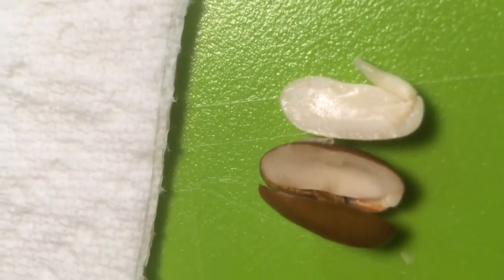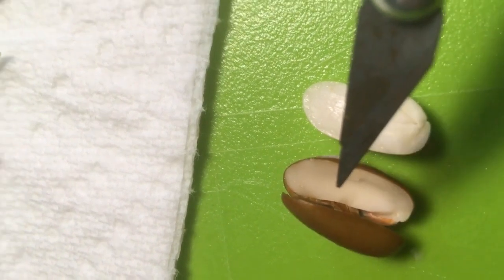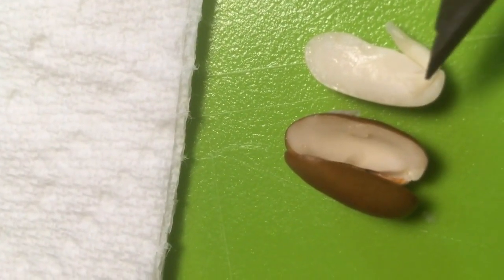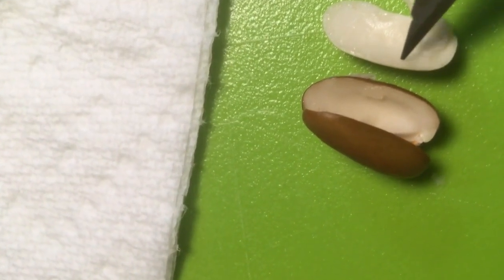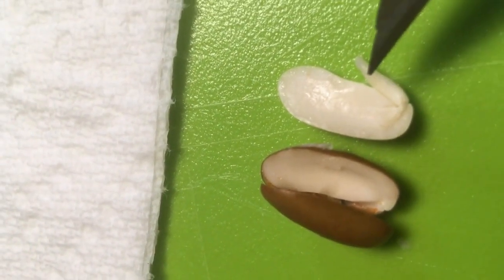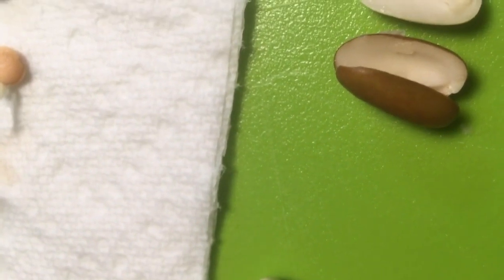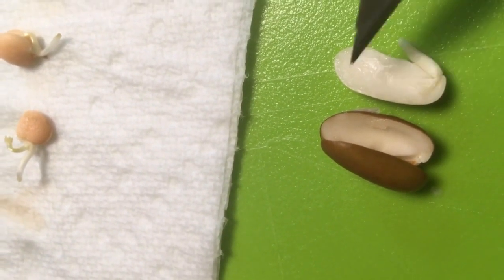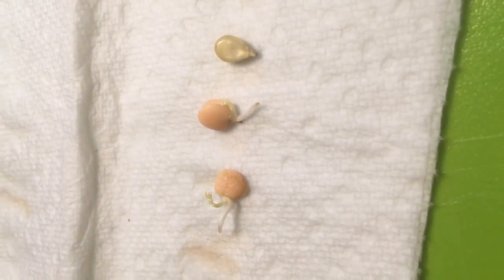There's another one, so you can see that skin right there, what we call the testa, and also you can see that root again, and then there's that feathery bit right there—we call that the plumule—and that we call the radical, it's going to become the root, and then there's that food store in there the plant's going to use to get itself ready. We've got some other seeds here to check, so let's check those ones out too.